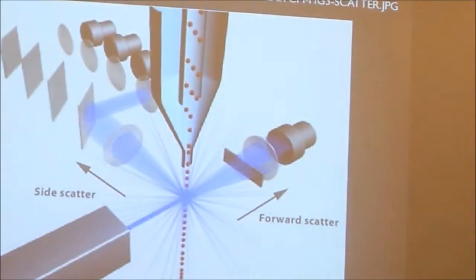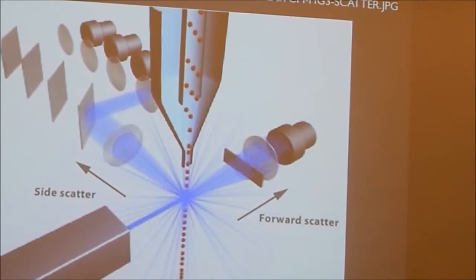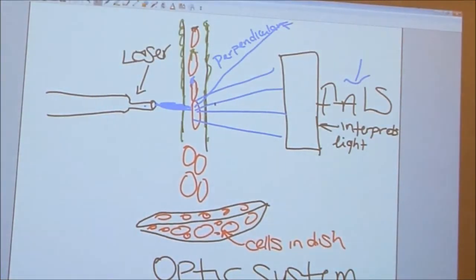fluorochromes are attached to them, and they're excited and they fluoresce. They emit a special color. So let's say red blood cells, or just any cells in general, this might exhibit this shade of light, this exhibit this shade of light, and this exhibit this shade of light. So they're then directed into the color detector. The color detector collects the different light that are emitted by the fluorochromes.